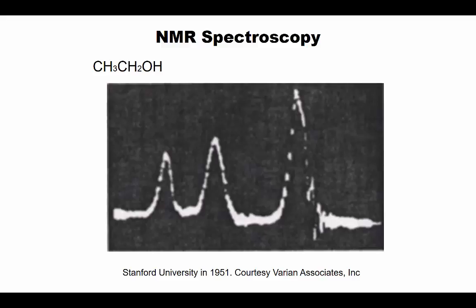Looks like quite poor quality, isn't it? But this was the scientific turning point to show the possibility of distinguishing different hydrogen atoms in spectroscopy. This ethanol NMR shows the different environment around each different hydrogen nucleus.